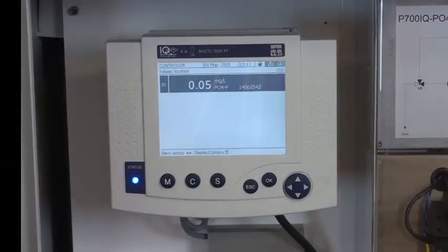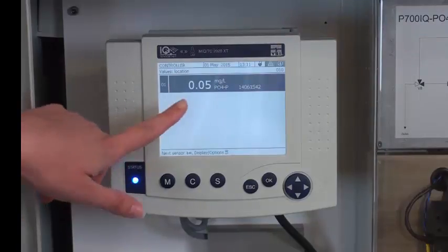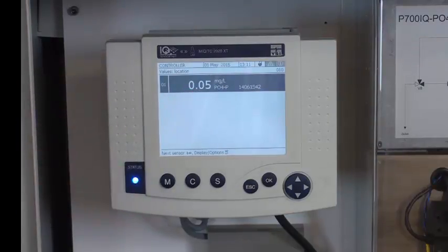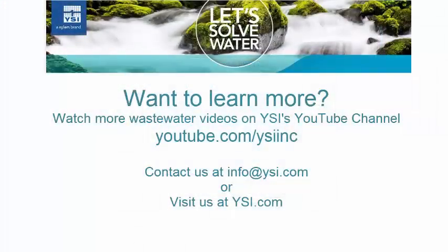After five minutes, it has its first measurement and that's displayed on the screen here.